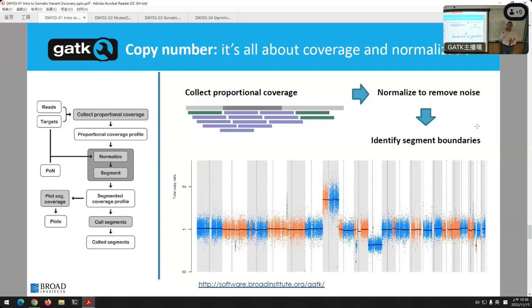But we told you earlier, and you'll see it later on when I talk this afternoon, the exons get captured at different efficiencies. So some exons capture well and get sequenced well, and some exons don't capture well. Some sequencing centers use extra baits to help certain exons, and some don't. And it's very inconsistent across different kits.